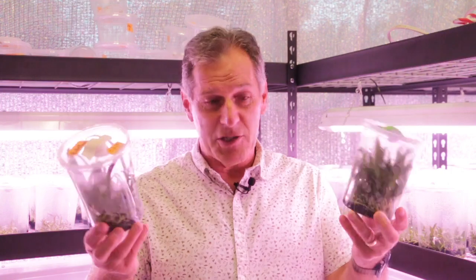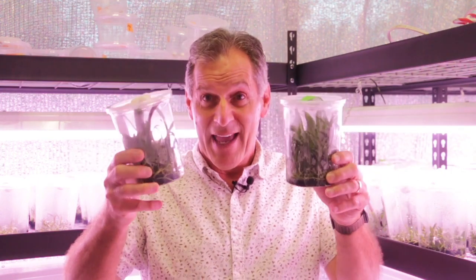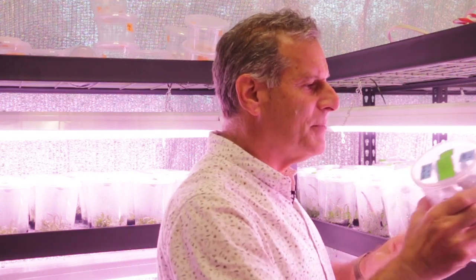What happens is I'm being pushed to move these flasks forward. I put a lot of effort into these flasks, getting them nice with nice root growth and nice shoot growth. Sometimes it's challenging to do the science when you have to push things forward. So I continue to do optimization of all different steps: seed germination, and the main step I'm focusing on is replating — getting the orchids to undergo rapid growth after you replate the seedlings after they have germinated. That's where I'm putting the most effort.